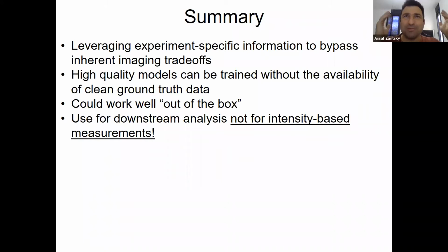If you want to look at developing Drosophila, a fruit fly, or zebrafish, whatever, we want to actually track the single cell. So what we want is the ability to do the post-processing. Notice that we're not making any assumptions about the specific intensity measurements in each pixel. I mean, we do that in the optimization process, but counting on that to draw biological conclusions, I would be very, very careful about that.